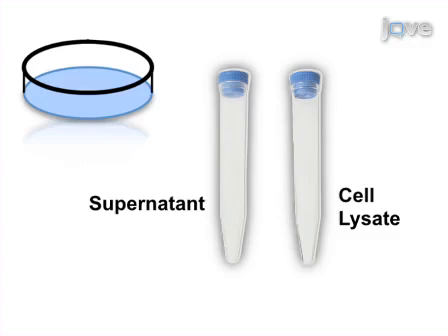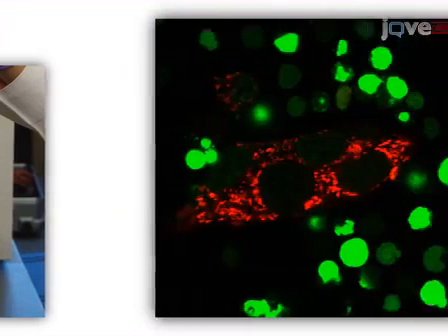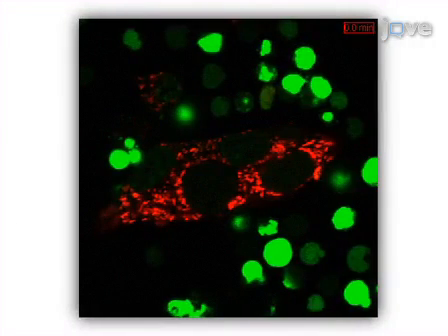using a gamma counter. To perform a visual CML assay, NIT1 and NIT4 target beta cells are labeled with mitochondrial potential dye TMRM. Effector cells are labeled with PicoGreen. The cells are combined and live cell imaging is performed to examine the rate of cell death, indicated by dissipation of mitochondrial membrane potential.